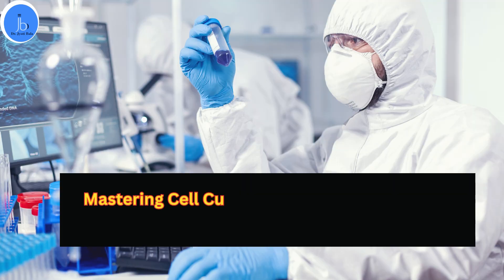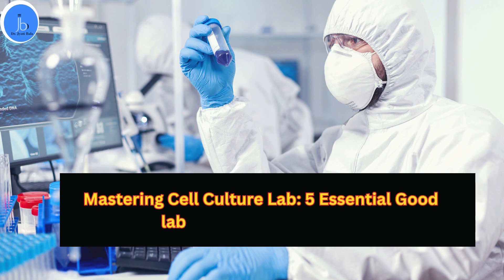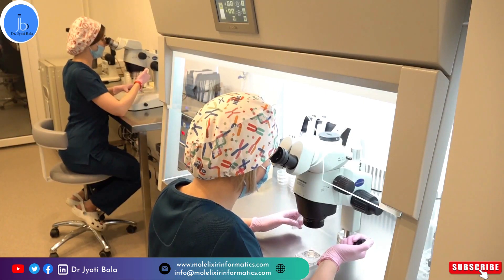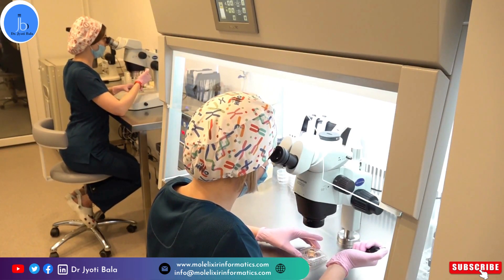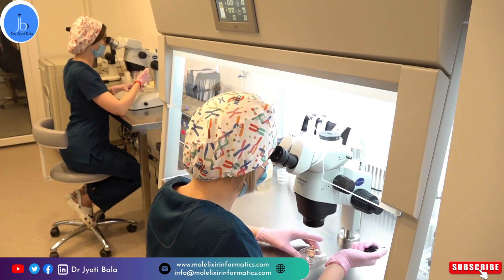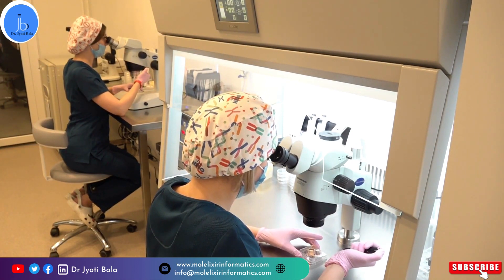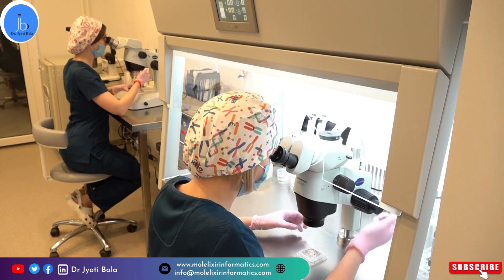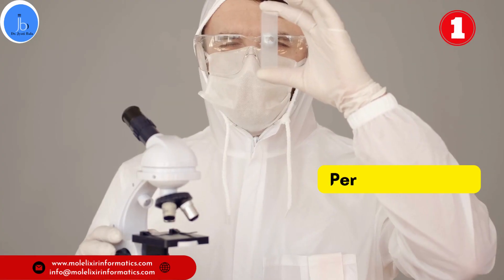Hi everyone, this is Dr. Jyoti Bala. I welcome you all on my YouTube channel. Today we will be discussing the top 5 good lab practices, especially if you are working in a cell culture lab. These practices are essential for maintaining a sterile and controlled environment to ensure successful cell culture experiments, which are quite needed in our biopharma, biomedical and biotech areas. So let's dive right in.